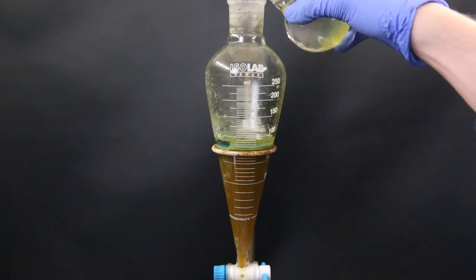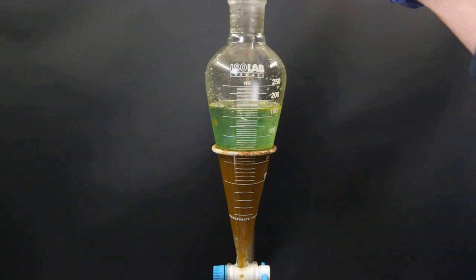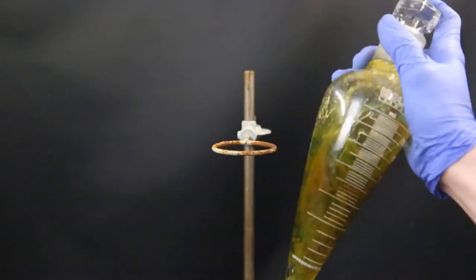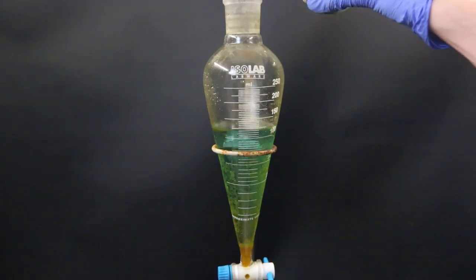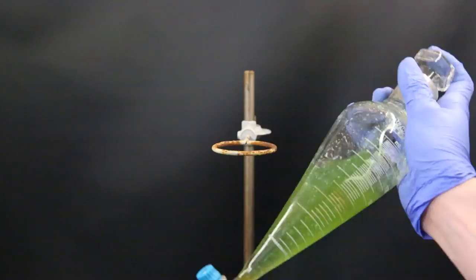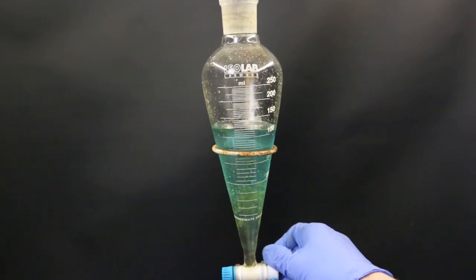I then move the mixture to a separatory funnel and dilute the upper water layer with some more water. I then shake it and drain away the lower DCM layer. I then extract the remaining water layer with some more DCM and combine the extracts.